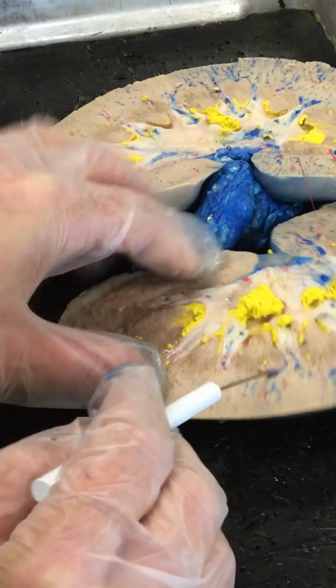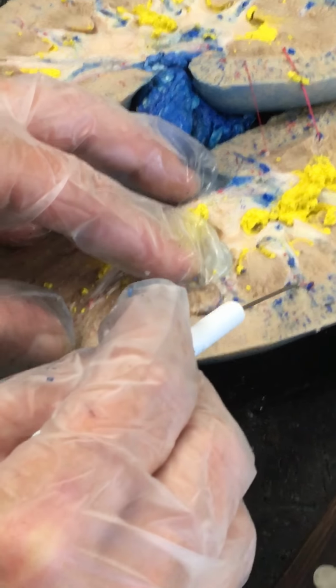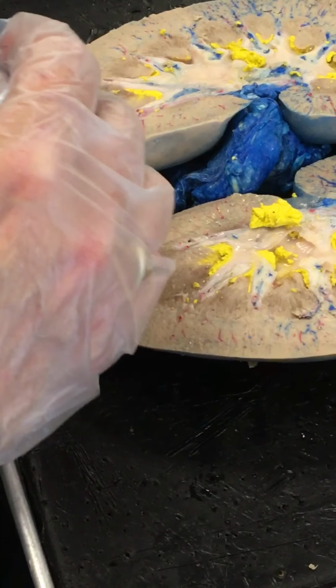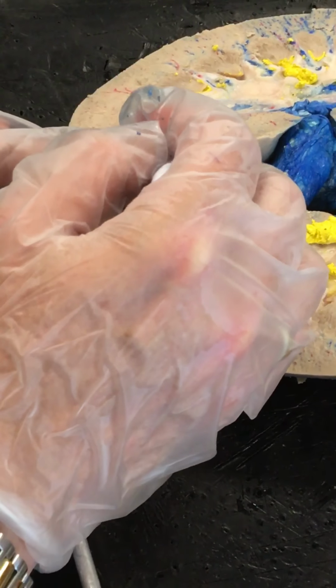You can see kind of an arcuate vein here. See how it wraps around and forms like an arch there? So the arcuate vessels arch. Then in the cortex, it's going to be the interlobular arteries and veins. So the one with the U is up in the cortex, the lobar is down in the medulla.